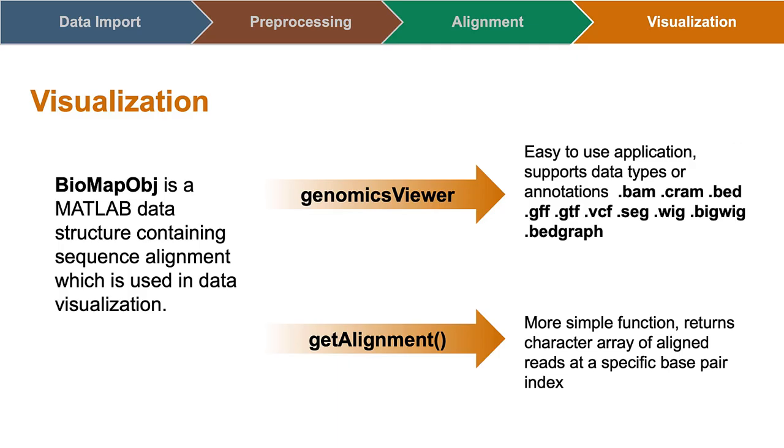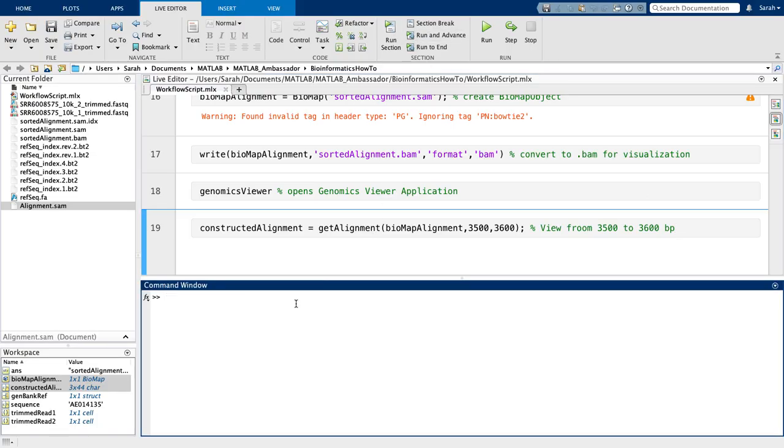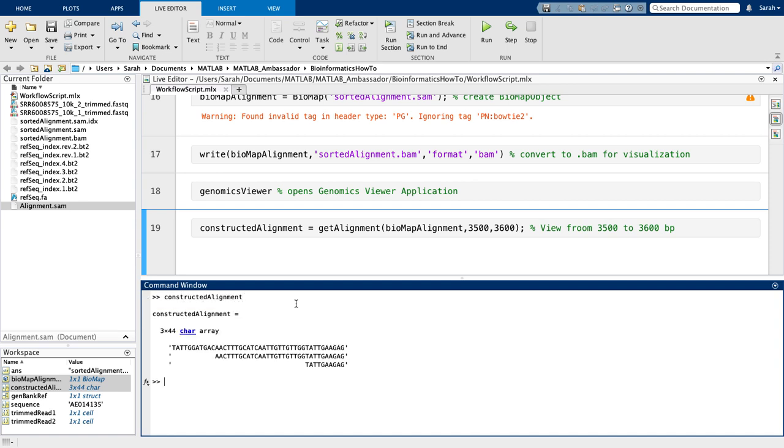Once I have created the object, I can also visualize a specific part of the alignment using the function GetAlignment in a specific base pair range. This function returns a character array listing all the reads that have been aligned within a specific base pair range, and if there are none, will return an empty variable.